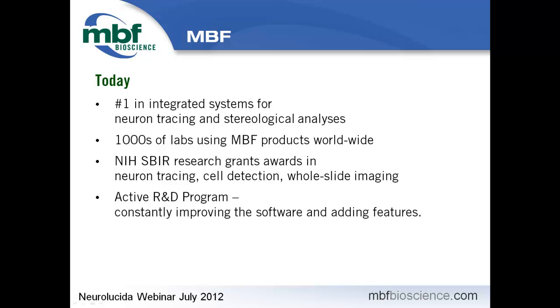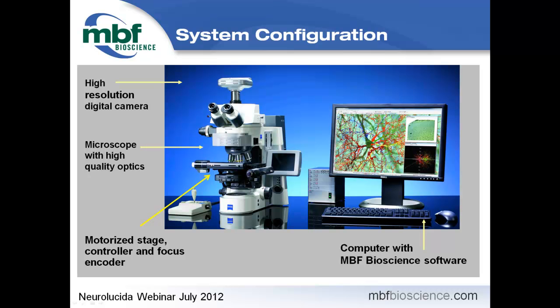We'll be concentrating mainly on the program Neuralucida today. A typical system for reconstructing and tracing neurons consists of a modern research microscope with a digital camera on top to bring the image to the screen. For today's demonstration, we've captured images — both single images and image stacks — and will demonstrate the program's capabilities on those images. A motorized stage is present, and a Z-meter keeps track of Z-position, allowing three-dimensional data collection.